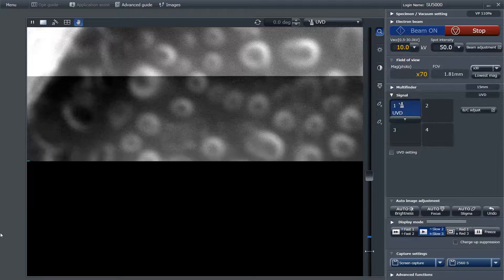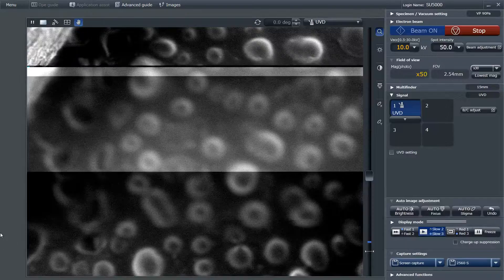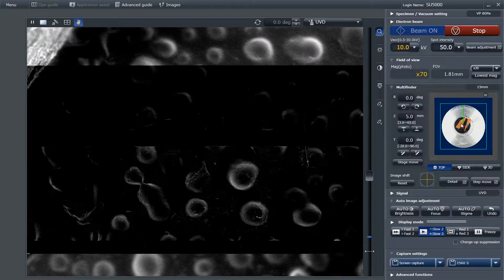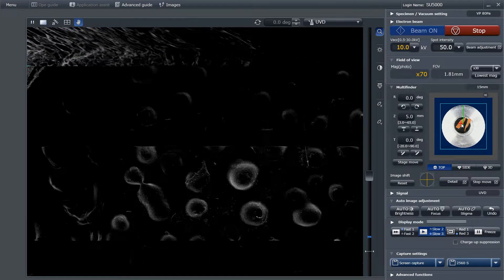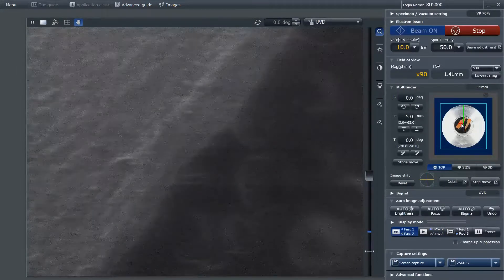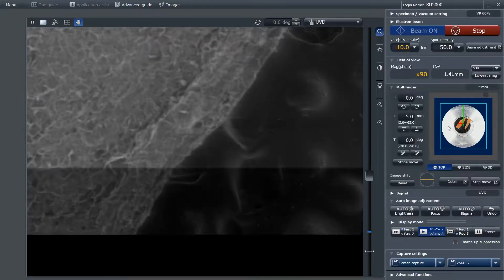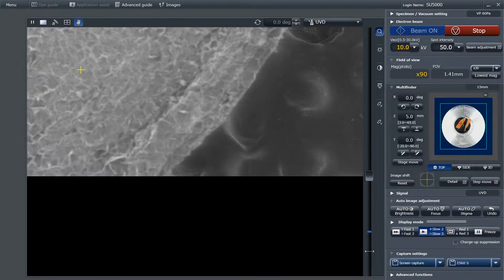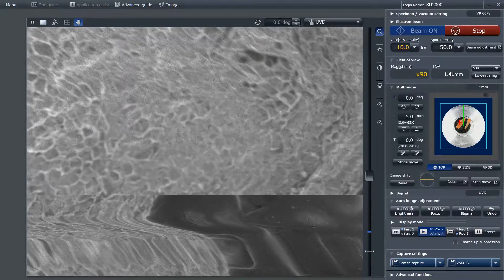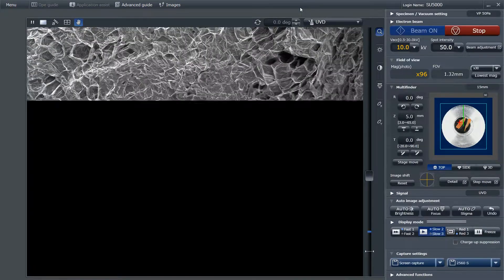We have the first image. Now I'm reorienting the sample so that we can get a better image of it, and adjusting the focus and brightness to get the optimal image.